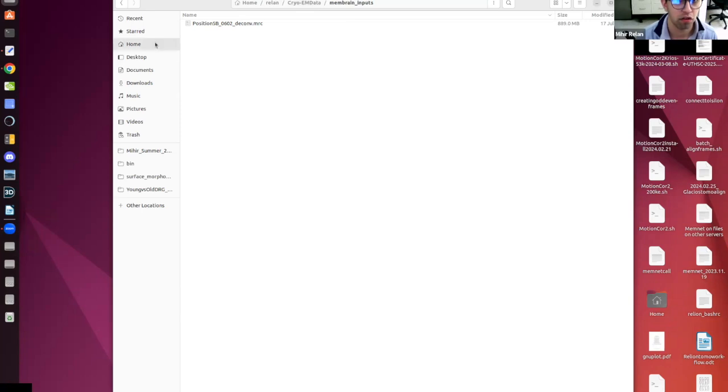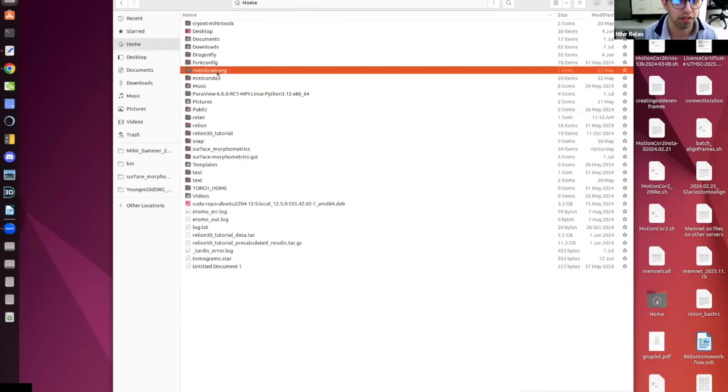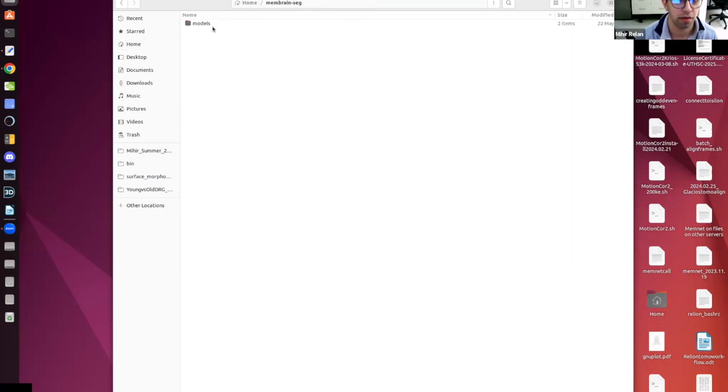One thing I'll also show you is on my home, you can see this MemBrain seg. We've downloaded it from the GitHub, and so we can see it here. We have the models, and this is the model that we'll be using, MemBrain seg v10.